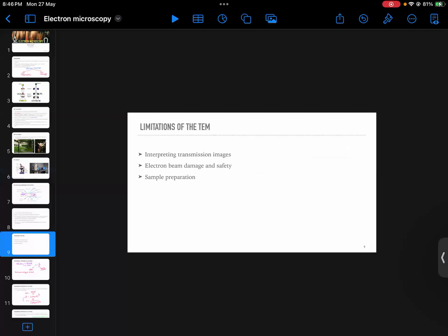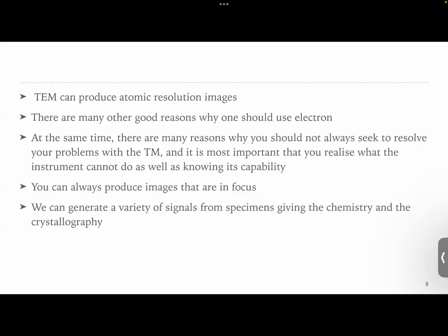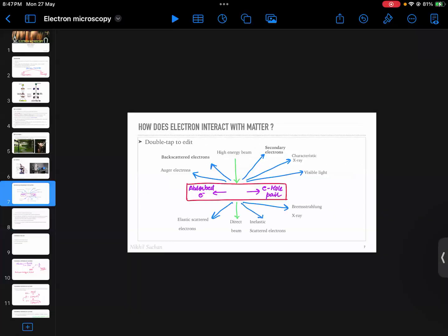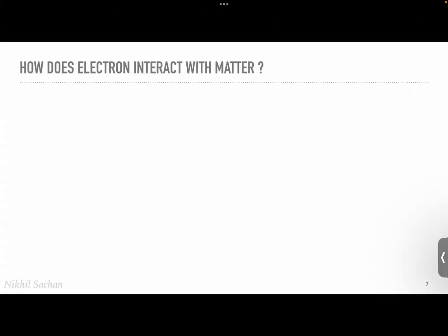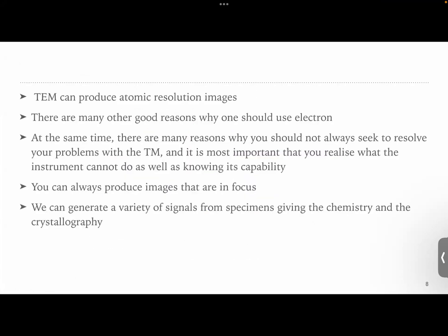Yes, sir. So then we understand the shape, or maybe the surface morphology of the sample, by the scattered electrons? Yes. If we want to know about the surface morphology, we use the SEM technique. I understand now. Because in the SEM you will get the electrons back from the scattered surface towards you.